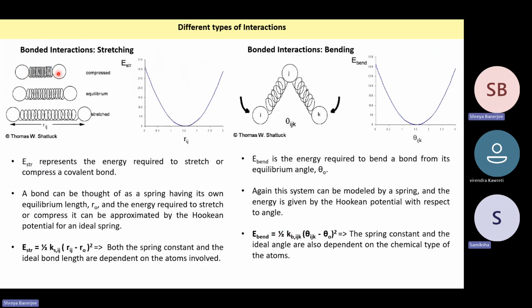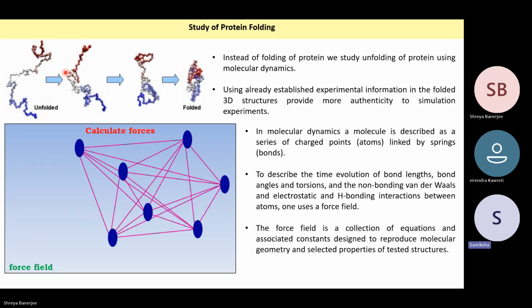So now we will. In that case, we have to put some values regarding the force field. Yes. Ma'am, so how will we know in which force field the protein is working nicely? So that also, there are certain rules for that.